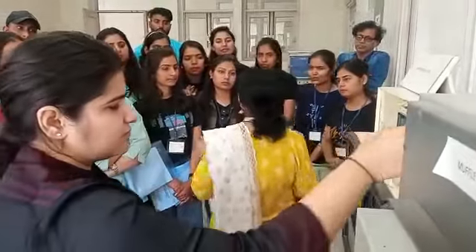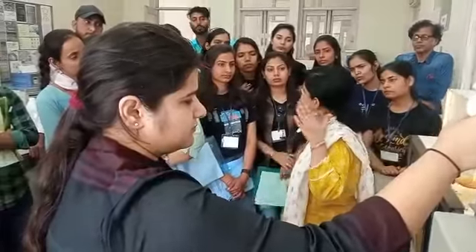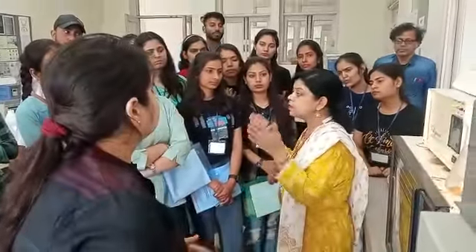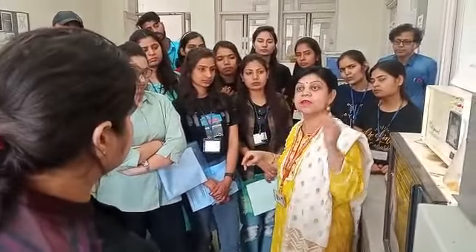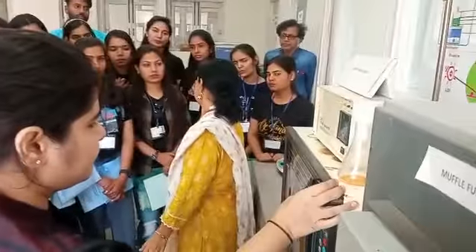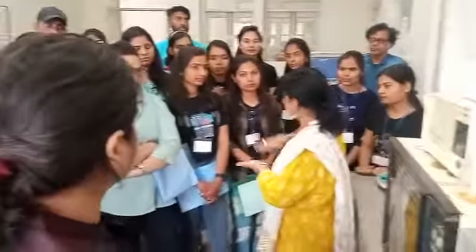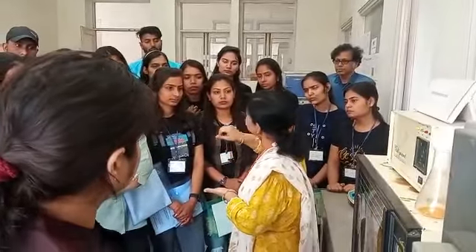You have to add ethanol in this, है ना? इथेनॉल में फिर क्या होगा ये? After some time you will see that this compound becomes solid. आपका solidify हो जाएगा, इसके crystals आ जाएंगे. You will get the crystals of your product. Okay, then you have to filter it. फिल्टर करने में you have to wash it for recrystallization.